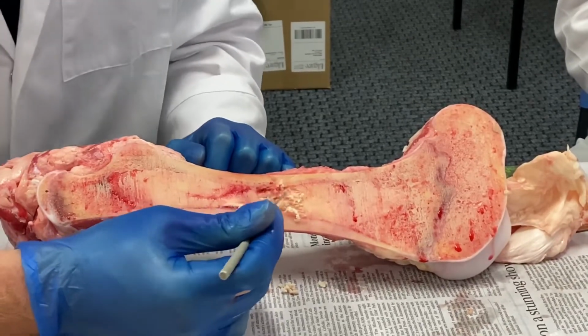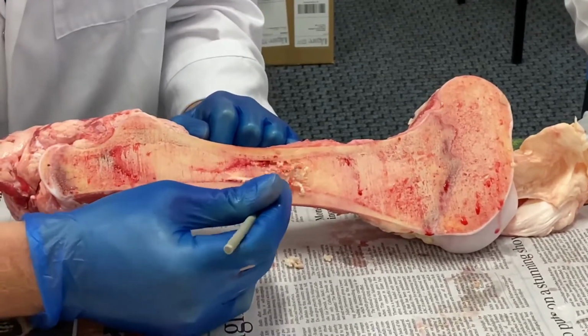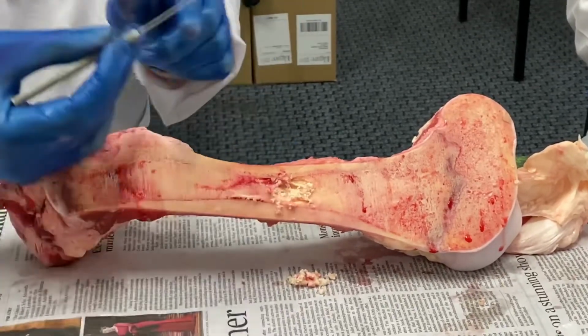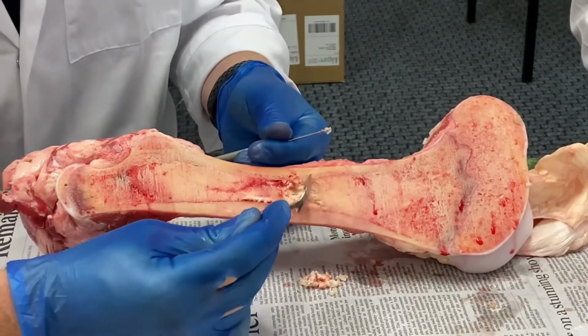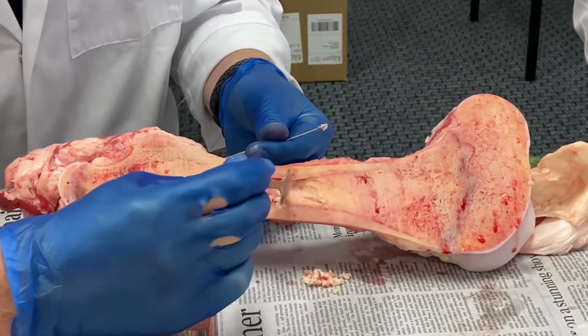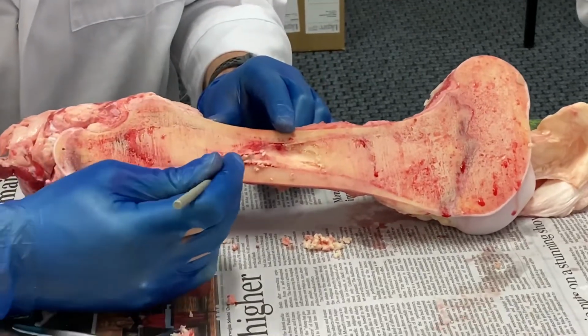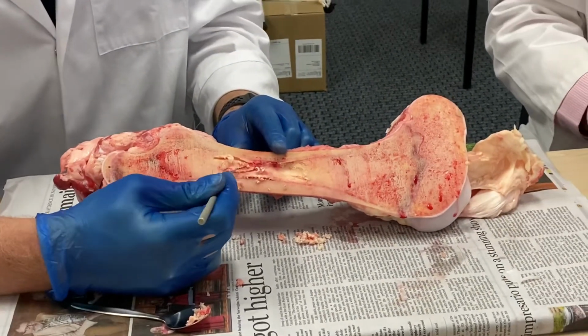It will produce fat cells, cartilage, and bone, and it's yellow in colour, but you can see now it's more white in colour or opaque. So very soft is what sir's going through, and we're going to dig this out now and come back to you with it completely empty.